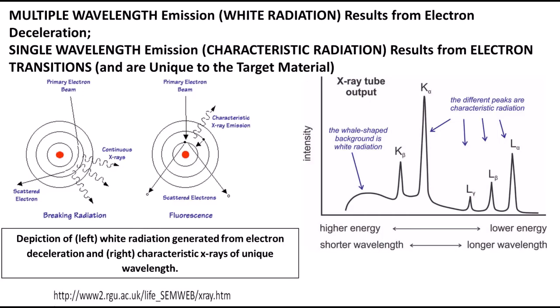When the electrons strike the target material, two types of X-rays are produced. The first type, referred to as continuum X-rays, are essentially a continually changing wavelength of X-rays. These X-rays are not of interest for this application because their wavelengths cover a wide range of values rather than a single monochromatic wavelength.